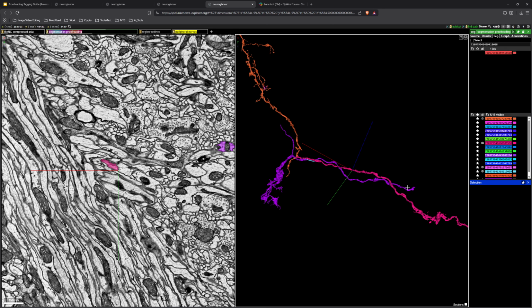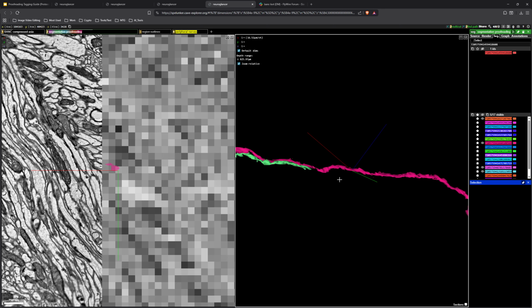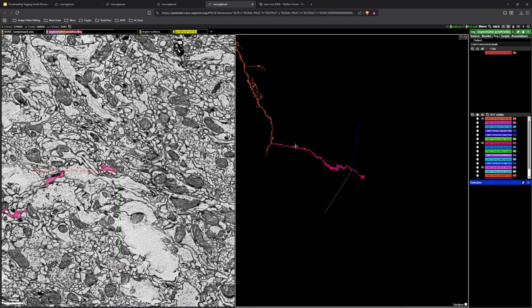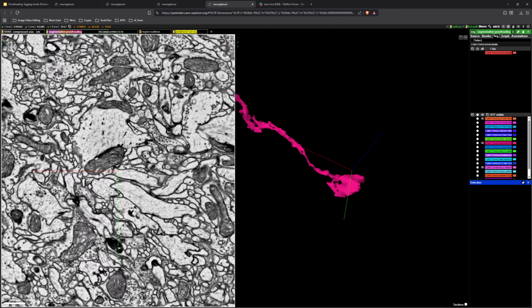Well, at least this cell continues in a similar way, and whatever this one is as well keeps going. So this is a typical path for this type of neuron. And luckily, I believe this is only a few pieces, maybe 5 pieces. So like this, then this piece, and then maybe 1, 2, 3, 4, 5, right? And it ended in a bouton, which is always a good sign, as we know.